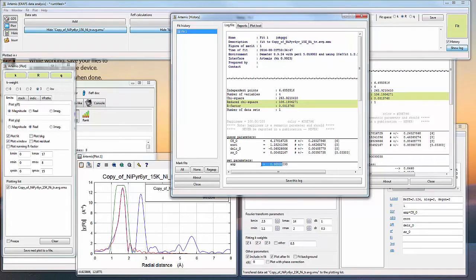But I also have to add in the error to the coordination number because I set this at 0.9. And there's a procedure to do that outlined in EXAFS for everyone, basically taking into account the assumption of this amplitude reduction factor being 0.9 if I assign it that value.